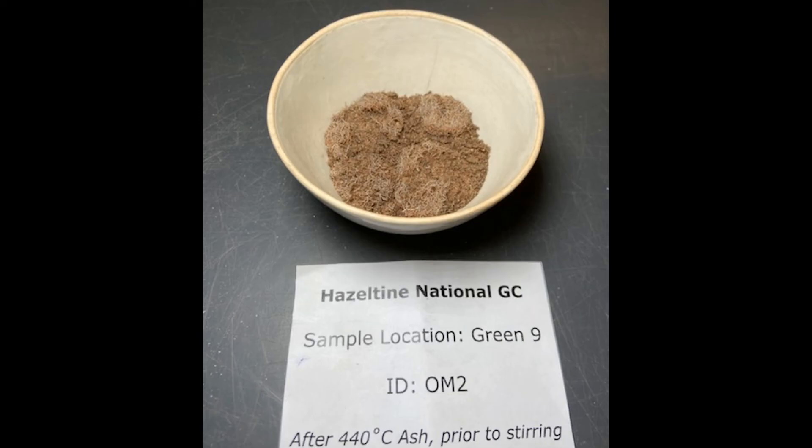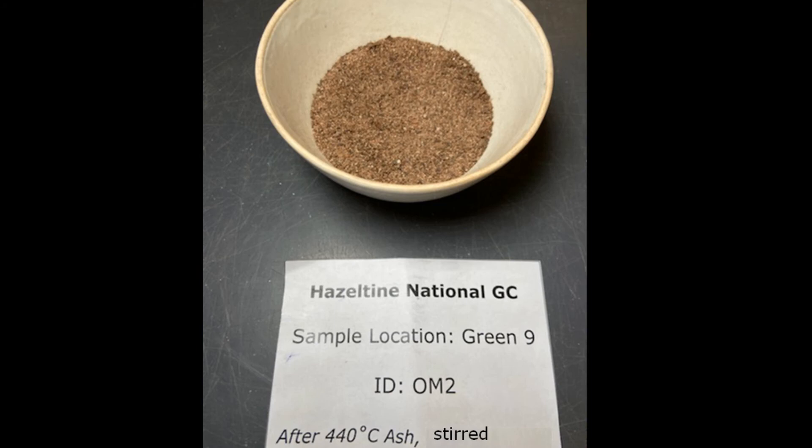After the burn at 440 degrees Celsius, this is what the samples look like. There's a white ash where the organic material was. After stirring the sample, it's simply sand.